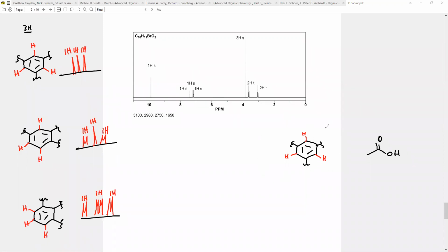But with that being said, I'm fairly certain my benzene is trisubstituted with this pattern here. So I can start to put things around. Sorry, I don't know why that was a carboxylic acid. It should be an aldehyde. But we have an aldehyde. That's the first thing we know, and it's a 1H singlet, which means that whatever's here has to have 0 protons. Just a reminder.